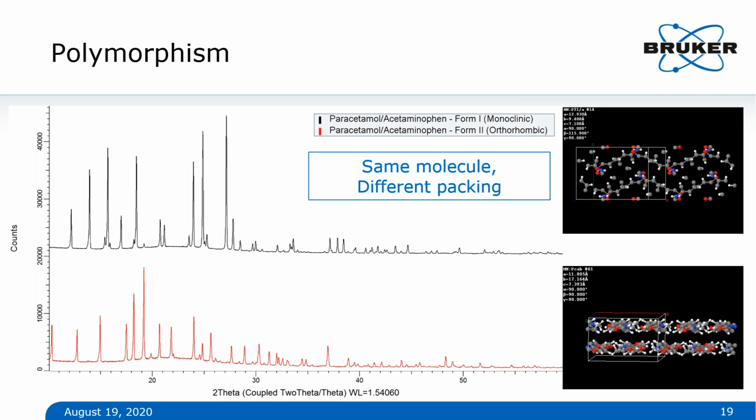There were studies about, do we do a liquid phase? Is it temperature for storage? Does it need to be stored under very, very cold temperatures? Is it humidity induced? So very, very interesting stuff all around polymorphism, that even though you had the right molecule, the long range three-dimensional stacking played a very strong role in whether this material was helpful or just completely not doing anything.